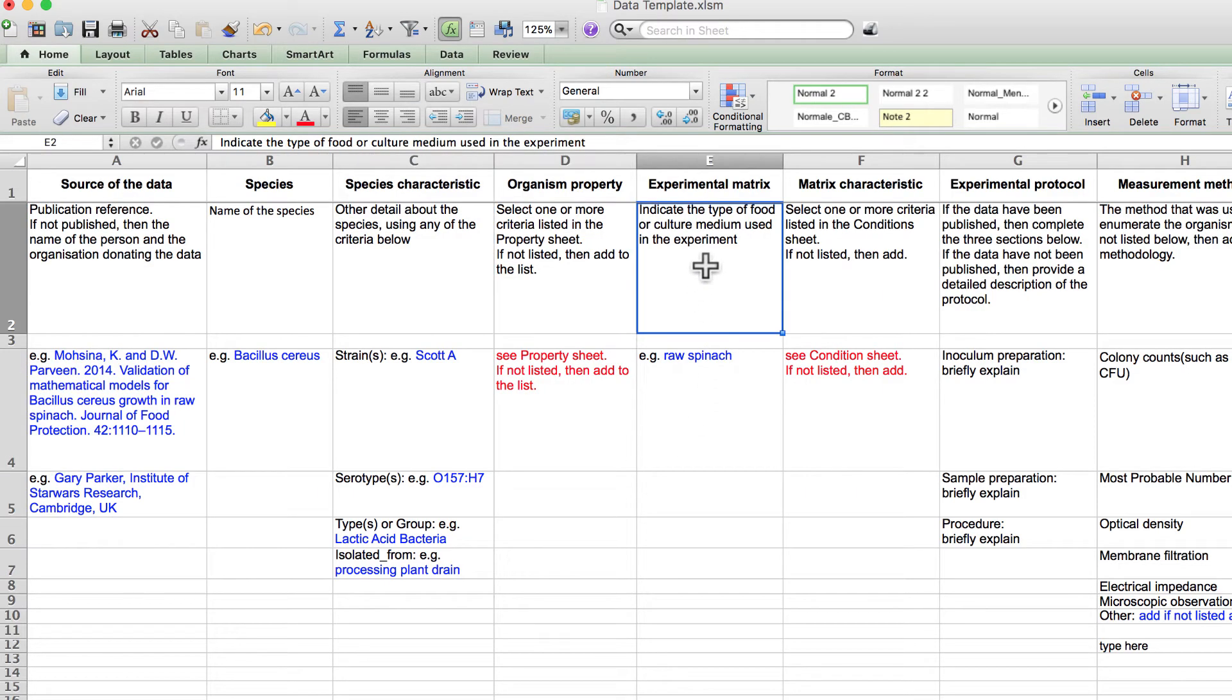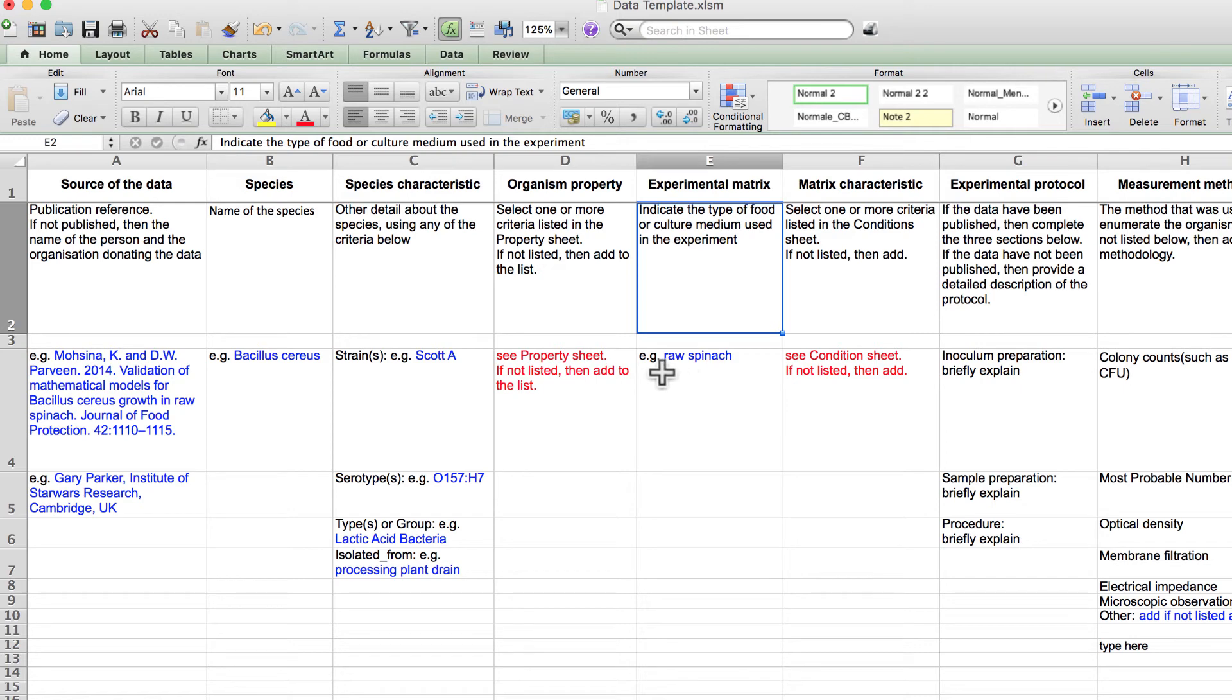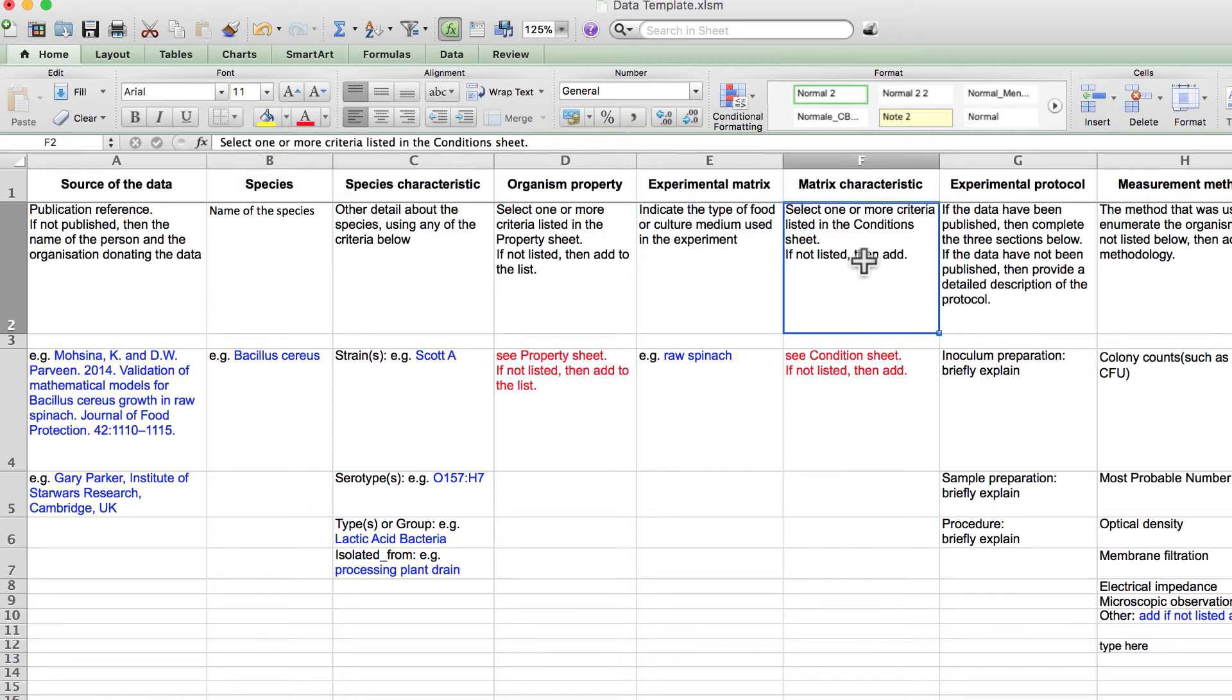Now let's go back to the master sheet. Column E refers to the experimental matrix, such as microbiological broth or a specific food that the organism was added to. Column F indicates information about the matrix environment. To see examples of these characteristics, let's look at the condition sheet.